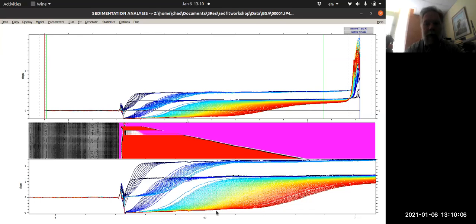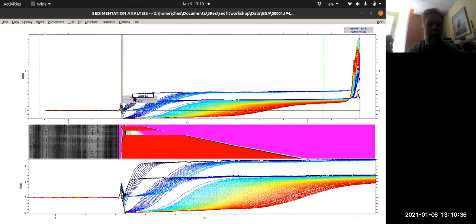So this is how the normal scan looks. It's got a couple of different weird features. There's this top window, and in this top window, there's a couple of things to see. There's a red and green line here and a blue and green line there. The blue line looks like it's set pretty well to what I'm calling the bottom of the data. If you remember the pictures I was showing you before, there's a picture of a meniscus where things look a little crazy. This is the meniscus here. We're going to take the red line and drag it over to the meniscus, and I usually put it somewhere in here.